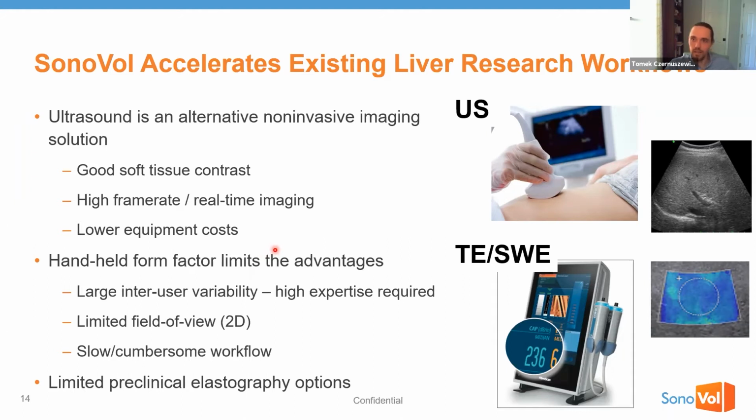This is true clinically, but clinically they have very highly trained professionals that spend their whole lives and get certified to become sonographers. So that's kind of how they've gotten around that problem. But preclinically, it's not as defined of a job, and there's fewer of them. And so the people that tend to take these measurements will be postdocs, grad students, people that may not have as much experience with the manual aspects.